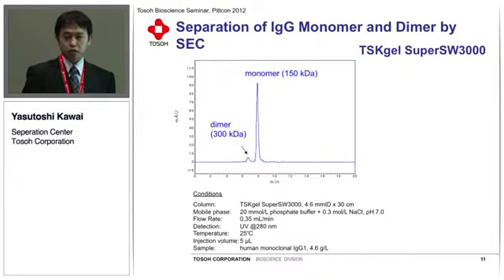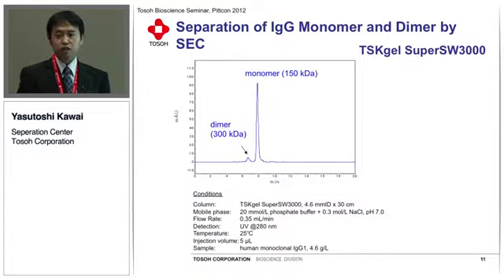This species might induce toxic side effects, so determination of them is essential for quality control of therapeutic antibodies.